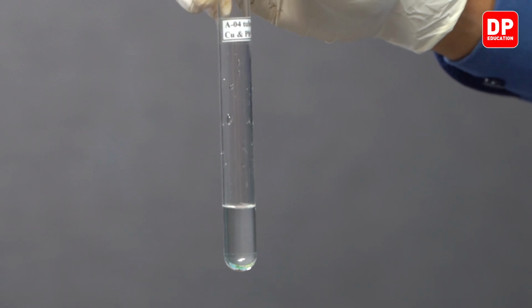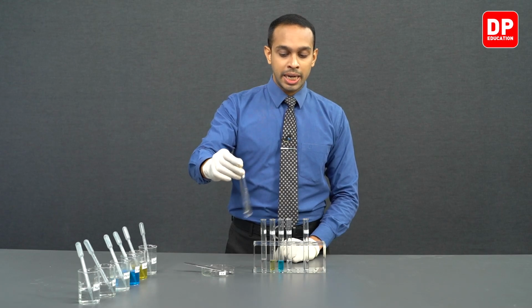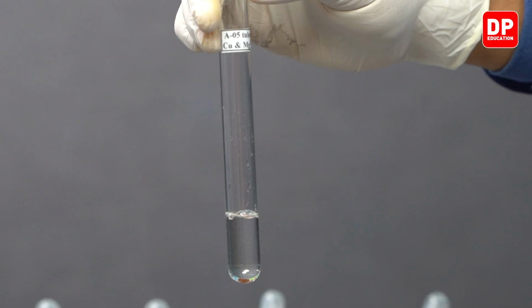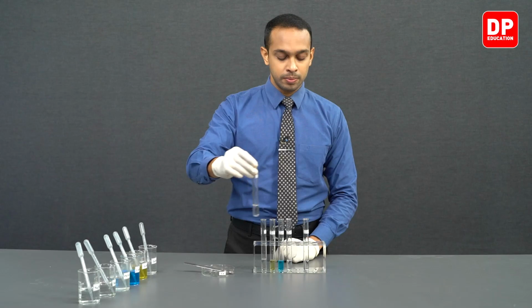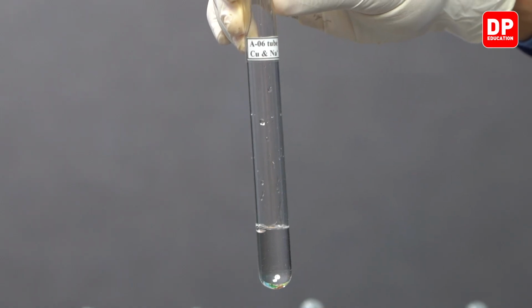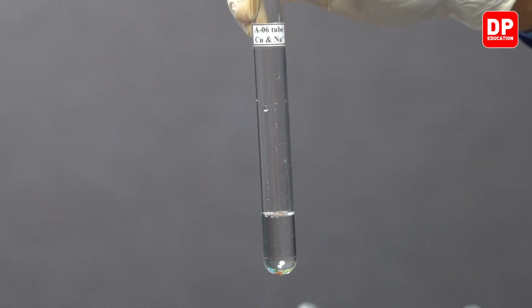No color change has taken place as well. When it comes to magnesium 2+ ion solution and copper, there has been no reaction here as well. And sodium 1+ ions and copper, we do not observe any reaction here as well.